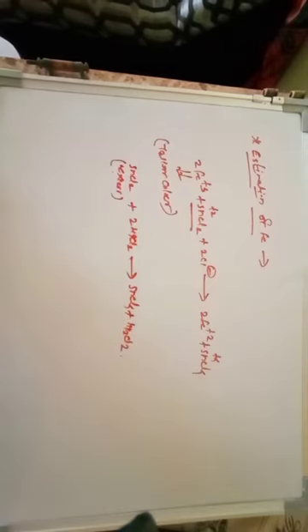So you should remember, whenever you have to determine the Fe from this ilmenite ore, you have to use an acidic medium, diphenylamine as indicator, and titrate with potassium dichromate. The conversion of Fe3+ to Fe2+ is carried out with the help of the tin chloride solution, and the excess tin chloride is removed by the use of the mercuric chloride solution. So this is all about the estimation of Fe from this ilmenite ore.